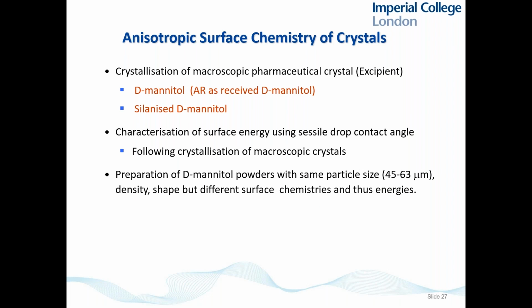So now I'm going to take you through a little project where we decided to investigate this technique and this approach in a lot more detail. And we used a material that you're quite familiar with, which is mannitol. What we wanted to know is whether or not the data we measured using inverse gas chromatography would agree with the data we would get using wettability measurements. And just to help you a little bit here, contact angle or wettability measurements are the standard method for determining the surface energy of flat solids. Of course, what you have here are powders. We did a special project where, as you'll see very shortly, we grew some very large crystals. And those crystals allowed us to understand the surface properties macroscopically and to compare those with the microscopic surface properties.